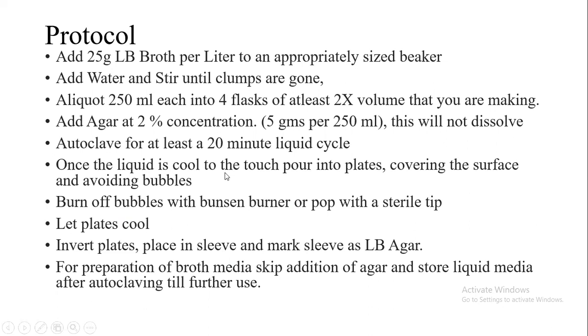After autoclaving for 20 minutes, the media is cooled to a temperature that we are able to hold or touch at the base of the flask. Then we work in the laminar air flow where we pour the media into sterile Petri plates. If there is formation of any bubbles, these can be removed by making use of a burner or with the help of a sterile tip.